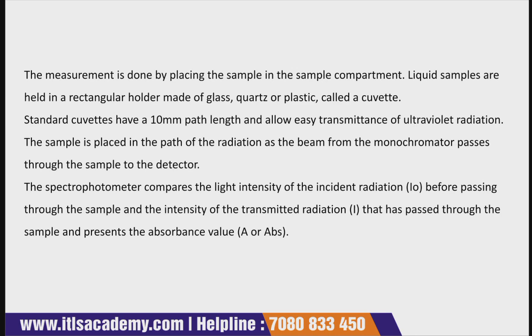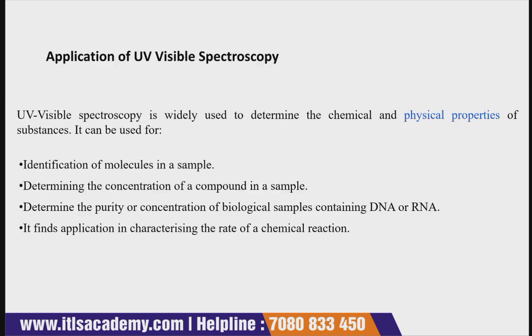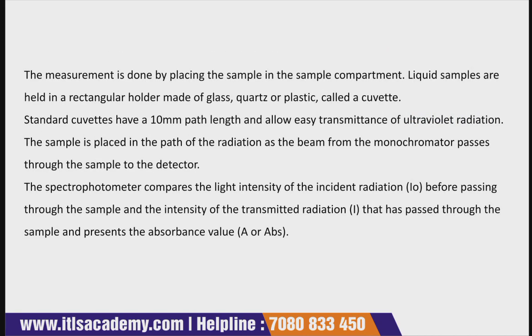Now how does the measurement take place? This is again very important. The measurement is done by placing the sample in the sample compartment.